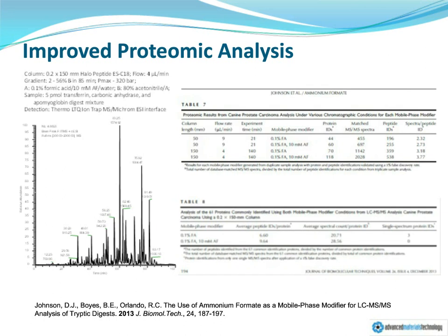And we have detailed this in the Journal of Biomolecular Techniques, where we looked at a tryptic digest separation, a complex mixture that results from the tryptic digest of standard proteins, as well as an actual proteomic sample, in this case from canine prostates, looking at the quality of peptide mass spectral identifications and the resulting protein IDs that come from that analysis.